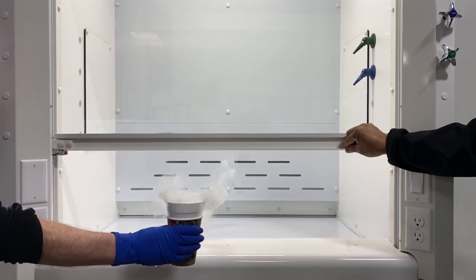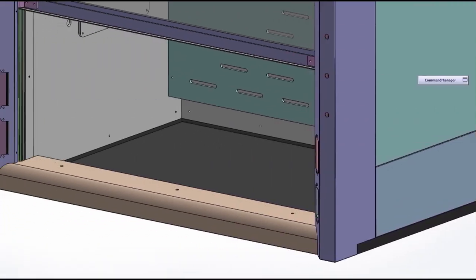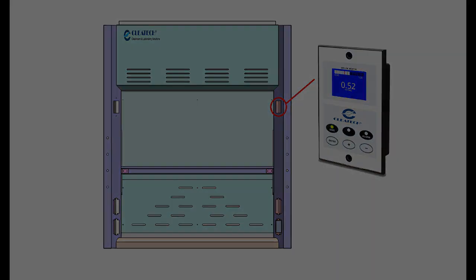Slotted rear baffle for proper airflow pattern and generating uniform air velocity. Dished work surface designed to safely contain spills. Airflow alarm and monitor to ensure adequate face velocity.